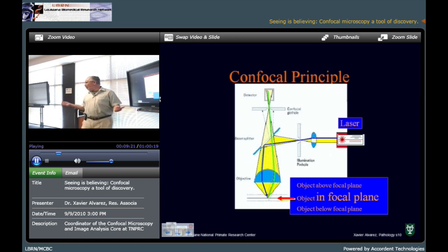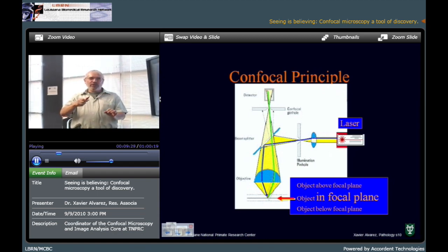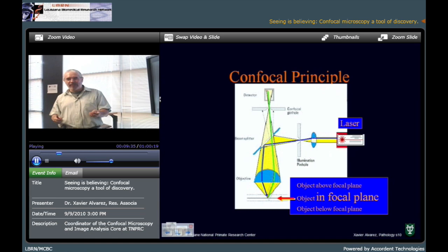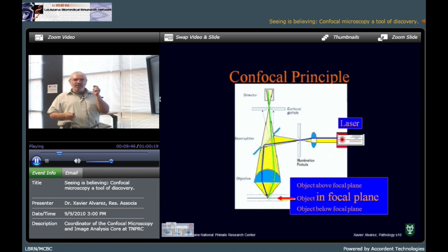Here too, any place. Okay, when you are burning the paper and you move your magnifier up and down, you reach the point that you have a little dot, very bright, and then the paper goes. When you find that point, you are finding the focal plane of the magnifier. That is the focal plane where it will focus all the light in one little dot. That is the focus of that magnifier.